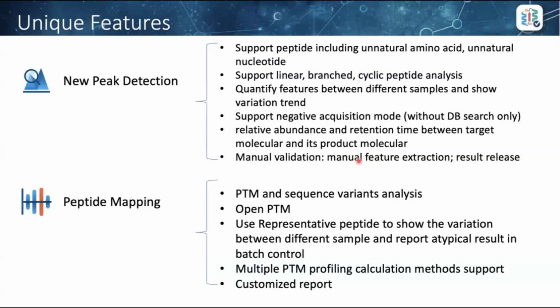So we can get biopharmaceutical metabolite trends through the time series. We also support the negative acquisition mode, and we can get more information such as relative abundance and the retention time between the target molecule and its product molecule.